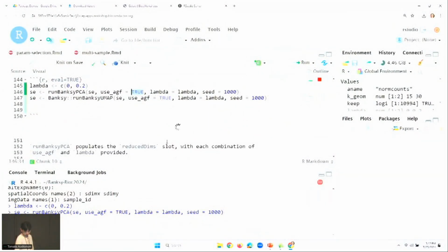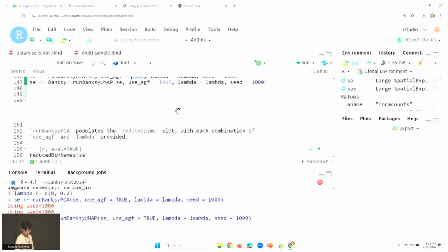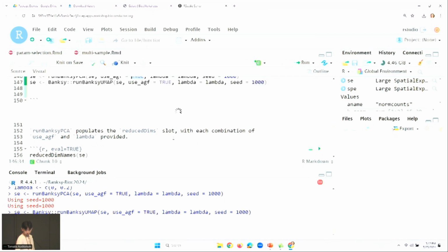I think you can answer that question very generally. If you have imaging data, you could directly use the pixel values, the channel values, but you could also use some sort of autoencoder to embed that data in some embedding space and append that as a set of features. We've not tried that, but that's the direction we're thinking of going. Actually, two directions.